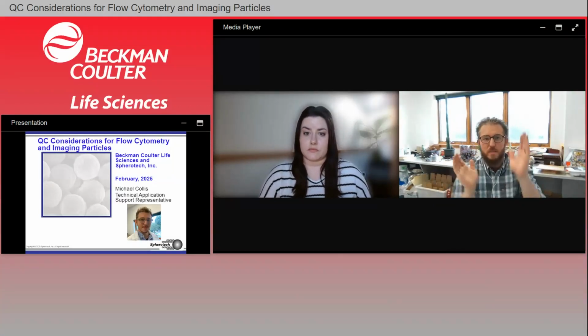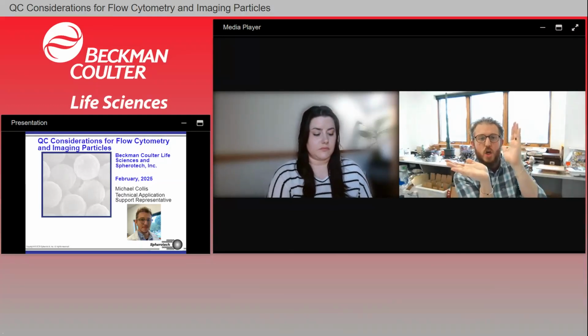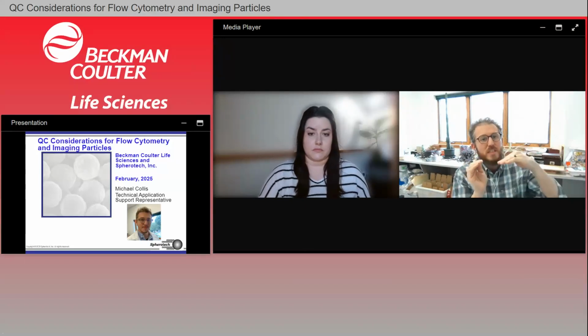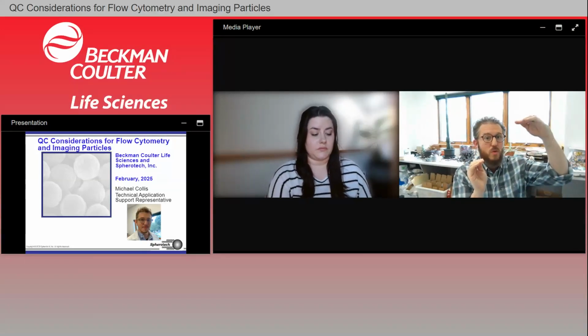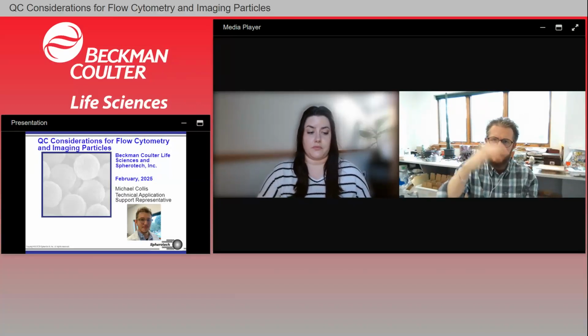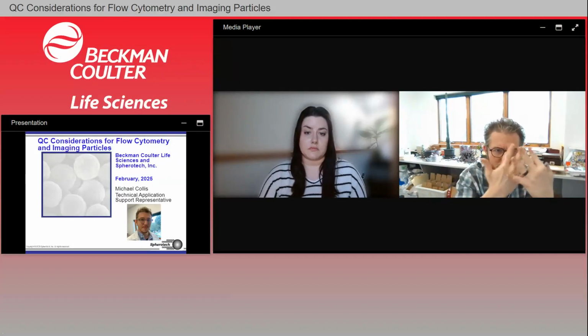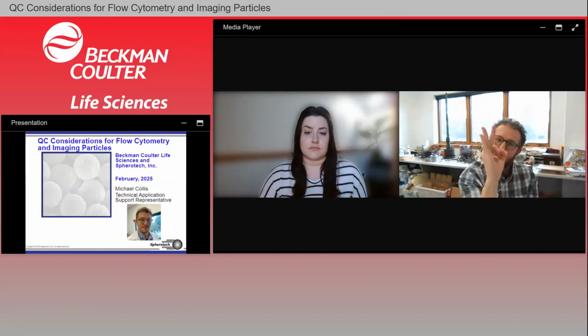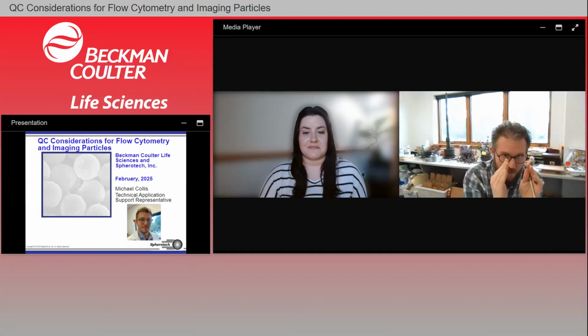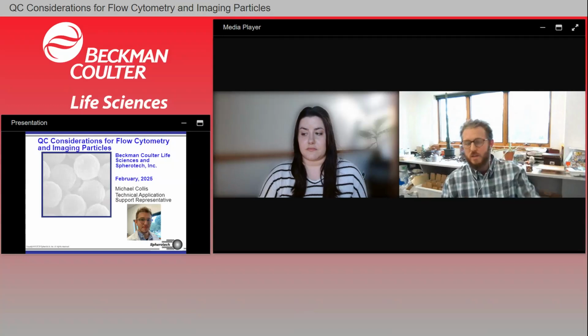So if you run these beads on side scatter and FITC, you can pull out the populations by that fluorescence marker, and then you can see how far it is into that noise in your side scatter, and then you can gate them. Although it may appear sometimes when you're just looking at forward scatter versus side scatter, it's all debris, it's opaque, you can't find it. Once you have that gate from the size standard saying there's these 3 or 4 gates in that low end sensitive range, you can then potentially say something more significant. And again, I could support you directly, but NFPPS, the nanofluorescent size standard kits.